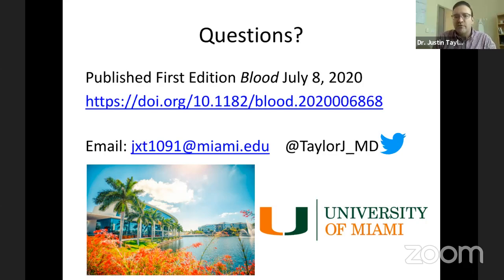I think if you can do it the way we did it, I think we've talked to Mission Bio again about maybe ways to increase the performance at that specific gene. But I think that's in the works. For the time being, if you have already generated the data and you wanted to try to analyze it, you can use our methods, and I'm happy if you reach out to me to share that with you. Great, thank you.